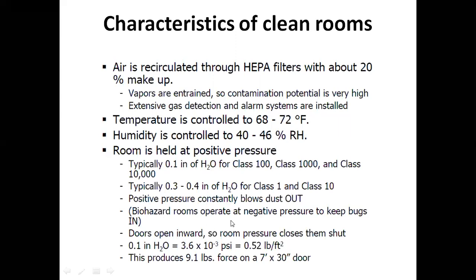Biohazard rooms operate at negative pressure to keep bugs in. On the other hand, in biohazard rooms where we are working with dangerous bacteria and viruses, or making toxic chemicals, they are maintained at negative pressure.